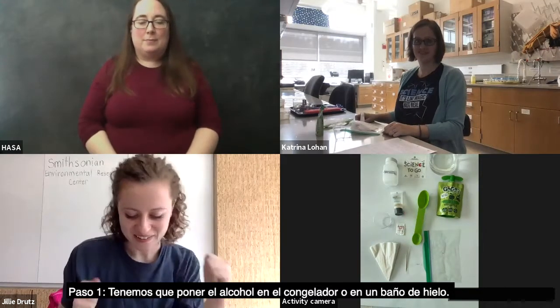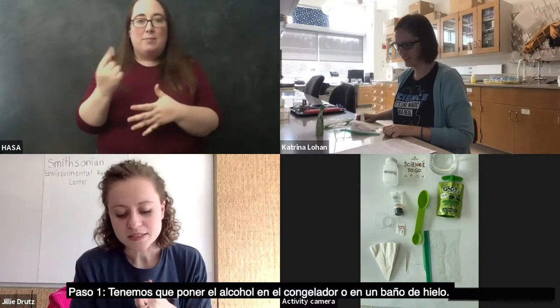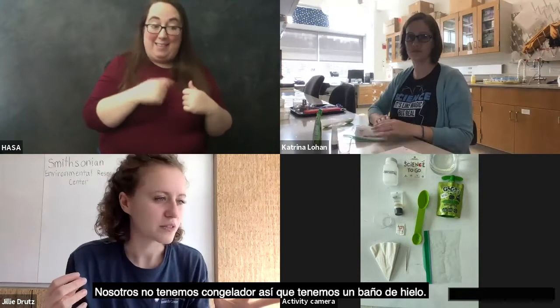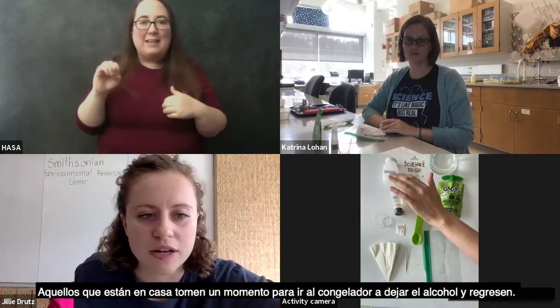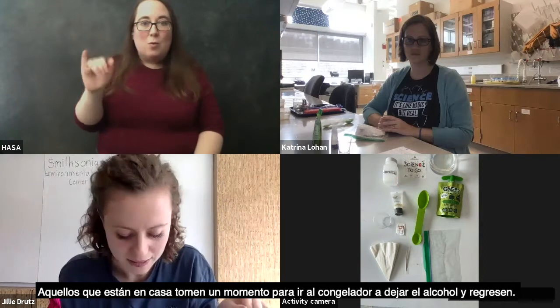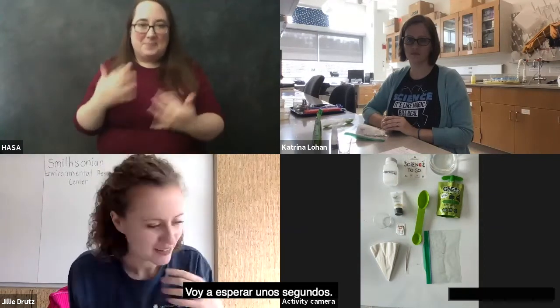Okay, cool. So step one, we need to place the rubbing alcohol in the freezer or in an ice bath. So like Katrina said, we both don't have a freezer next to us, so we both have ice baths. So if you guys want to take a moment to quickly run and put your rubbing alcohol in the freezer and then come back. And I'll wait a couple seconds for everyone.